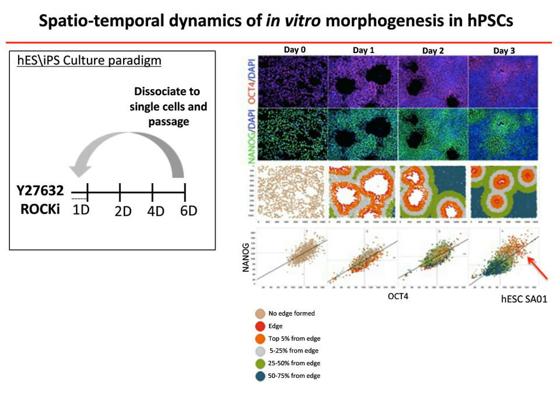With time, the red signal and the green signal become more and more associated with colony edges. So the edge in day 1 and day 2 is seen by the large black holes, and on day 3 by the pinhole that's surrounded by red and green.